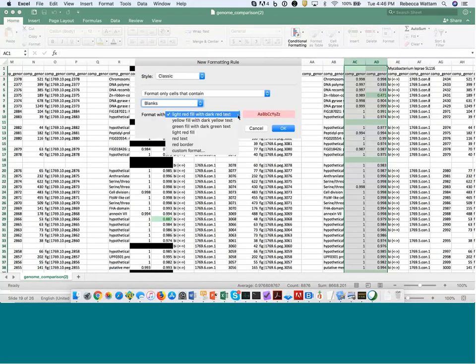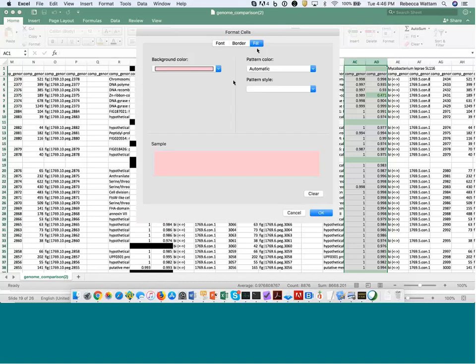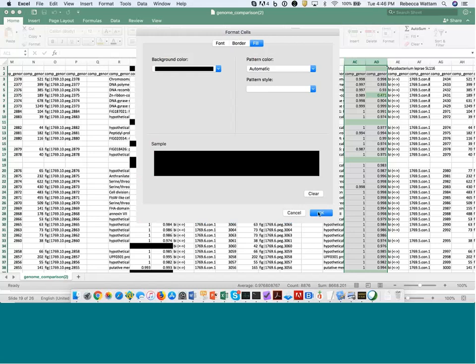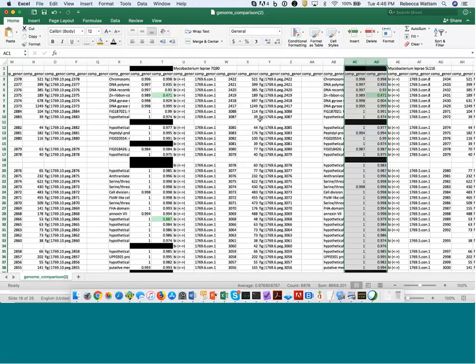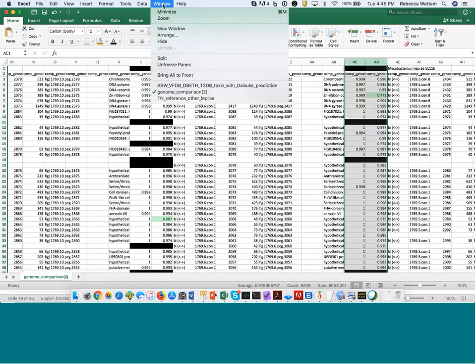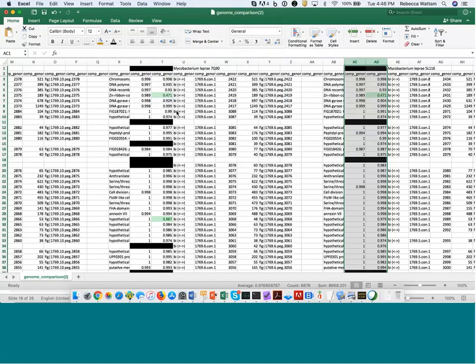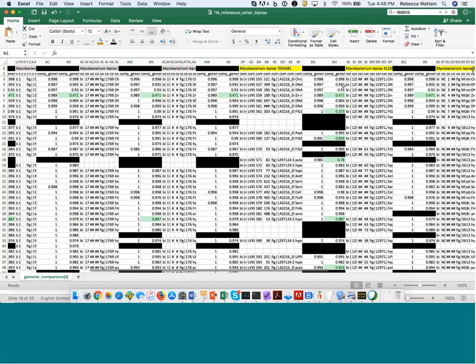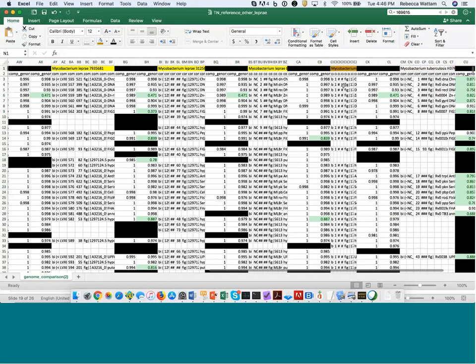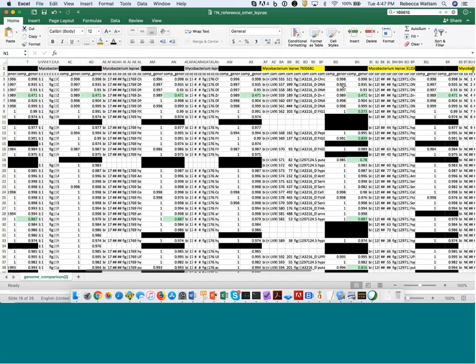I know it's a lot to tell you, but you can do this kind of thing pretty quickly with the tutorial. And then you can see patterns within your genome very quickly of things that have questionable coverage and things that are missing. So I wanted to show you this one that I worked on earlier. What I did was I colored everything that's gray up at the top are the isolates that were from armadillos. The yellows are the isolates from humans, and the brown is from the mouse. And I also included H37Rv.